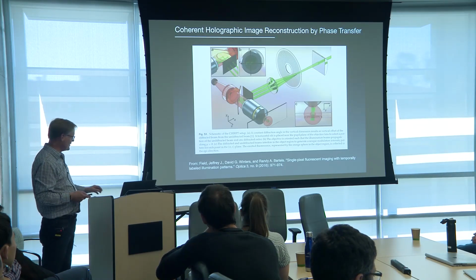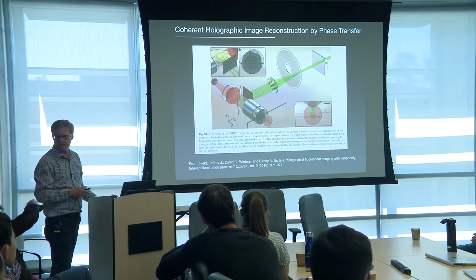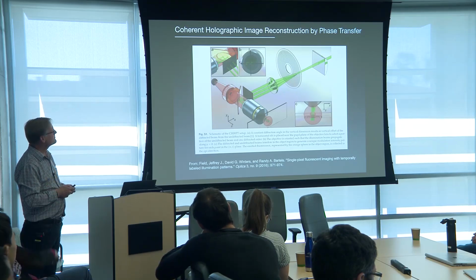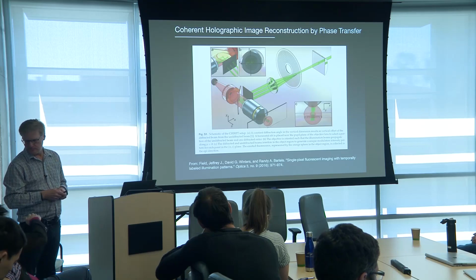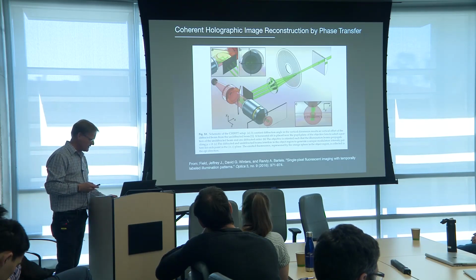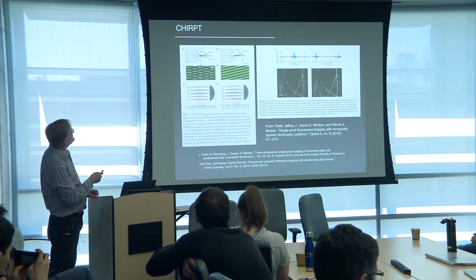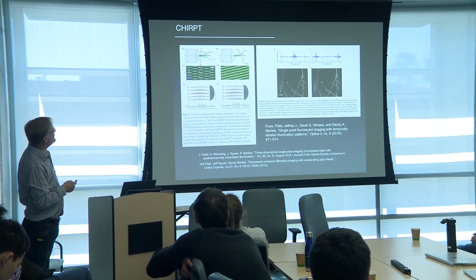I'm super impressed because I don't know what their thought process was to discover this. So this is SCAPE with a phase mask or with a rotating disk modulating the wave, generating a light sheet through the same objective. Yeah. So it's producing this. All right. Yeah. And what they did is, and this is amazing.